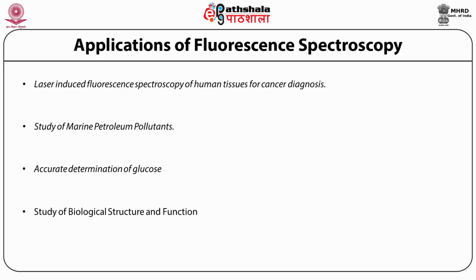The protein domain structure and motion on the sub-nanometer scale can be spectrally monitored using fluorescence resonance energy transfer, generally termed FRET, which is a non-radiative process where the energy is transferred between two fluorophores.